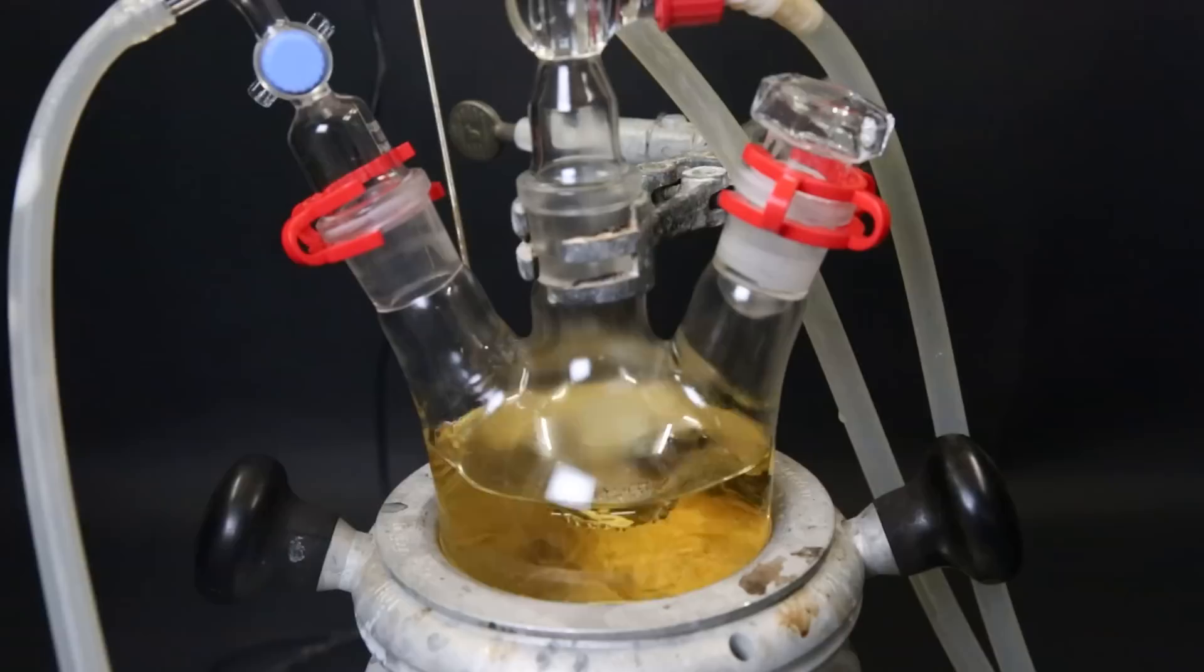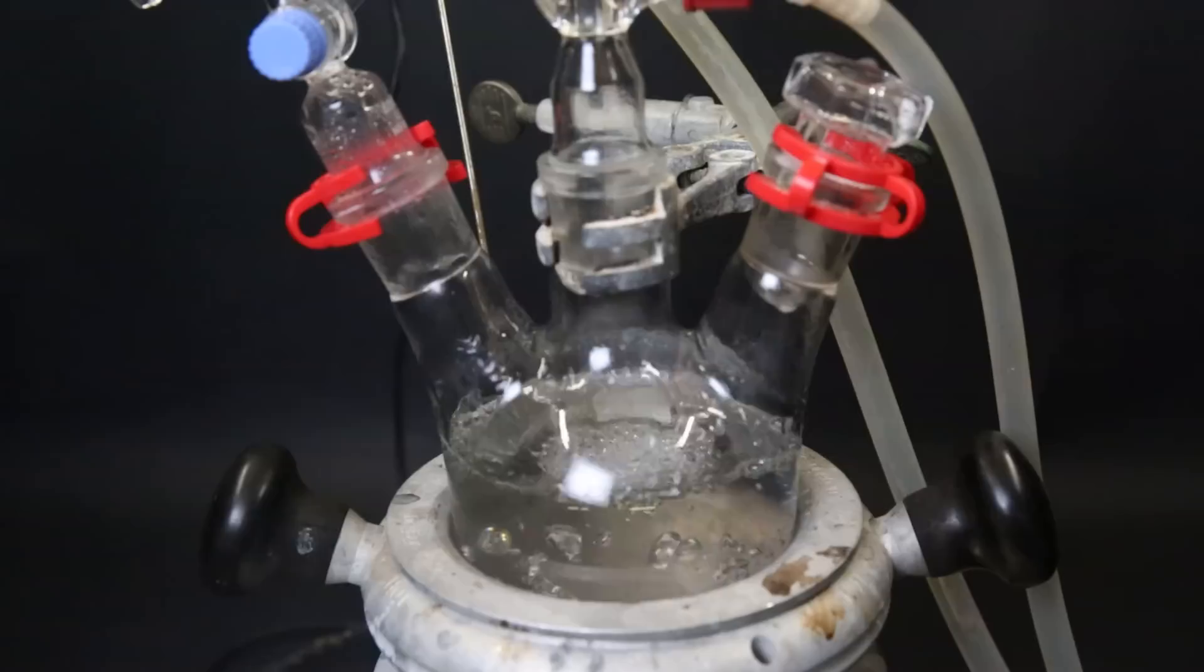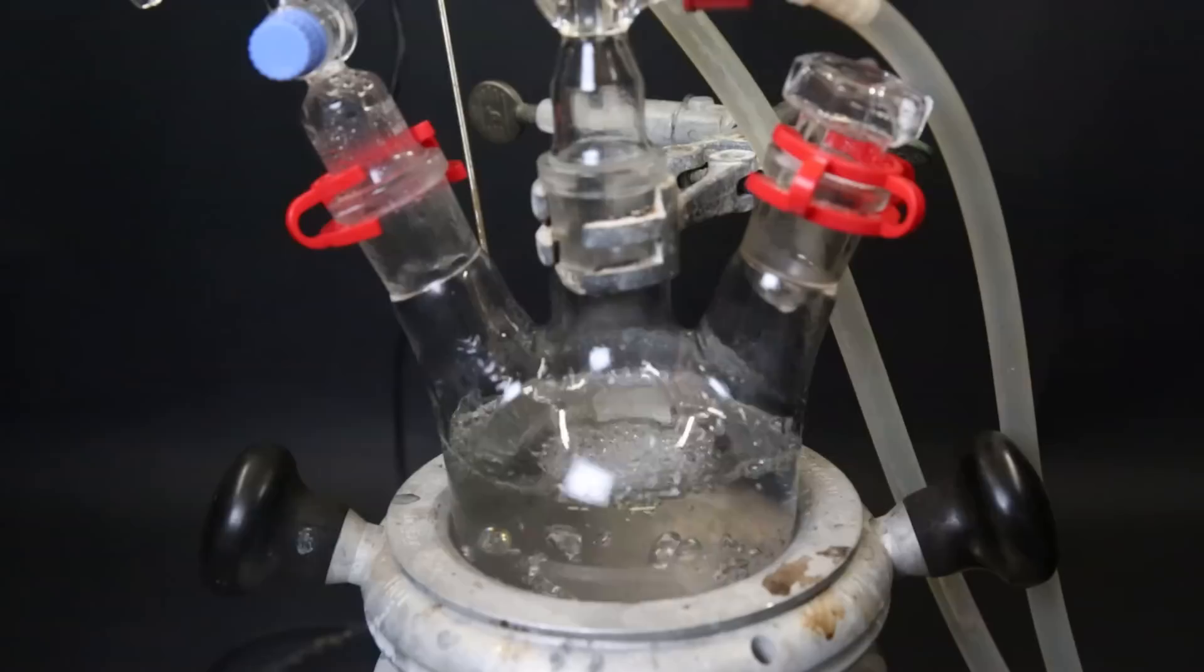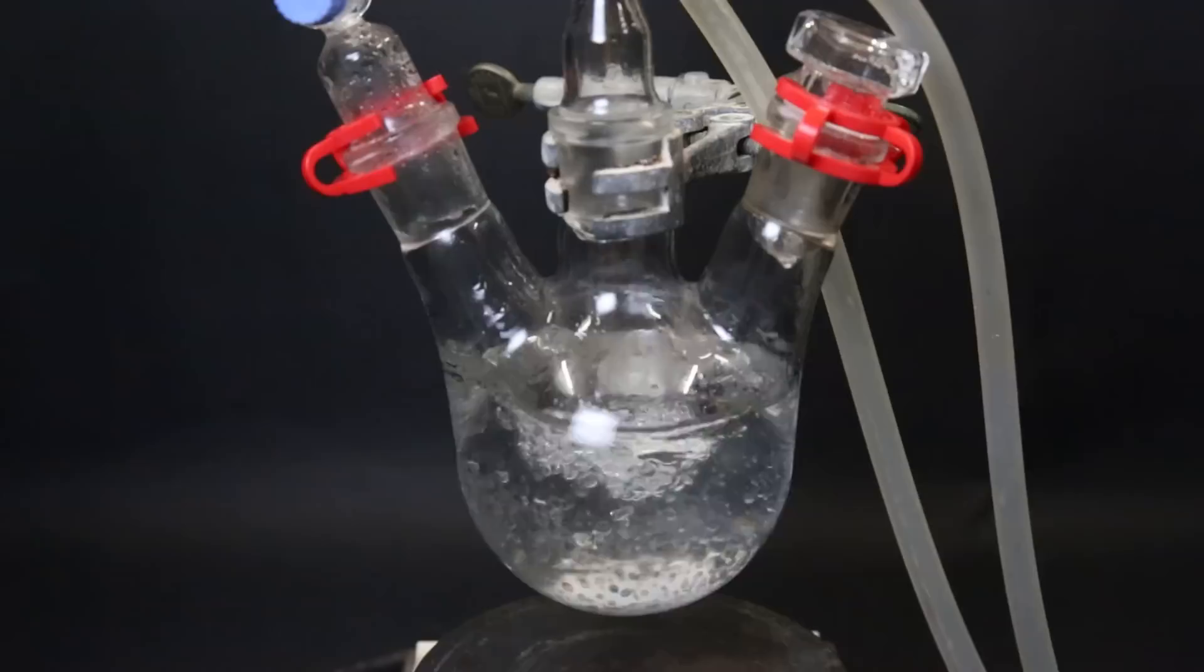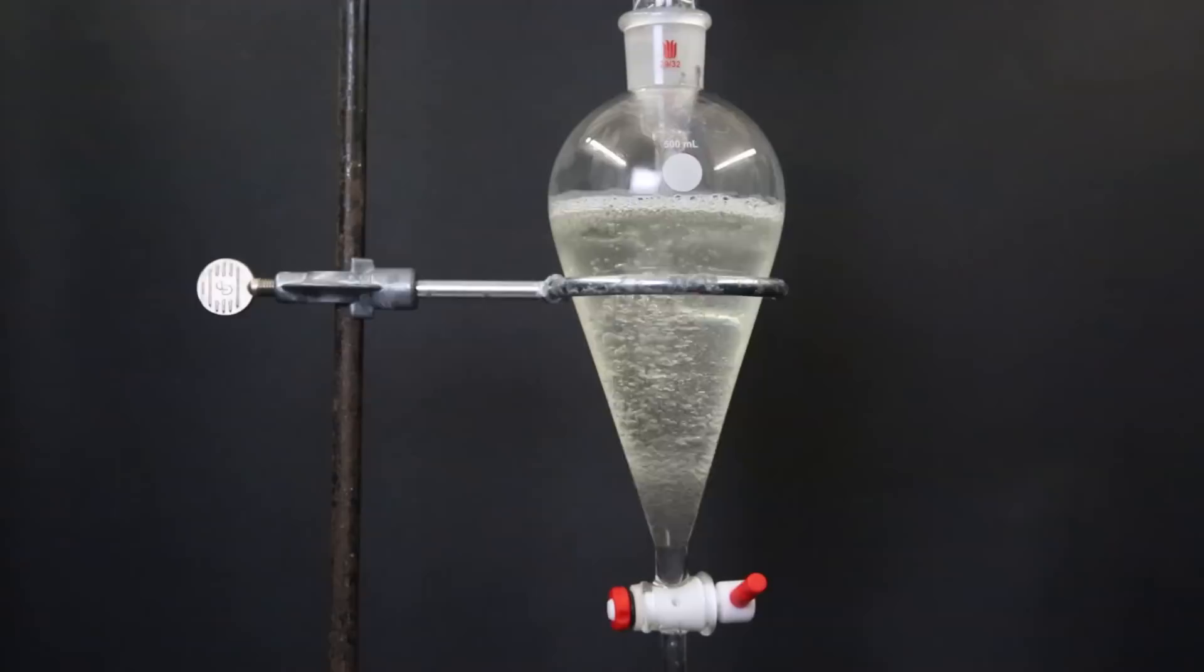Now that everything has been added, I heat the mixture so that it begins to boil, and I leave it to reflux for 24 hours. When I come back, the color has disappeared, and some black powder remains. This is because the catalyst degrades over time, and forms palladium black. I take it off heat, and then let it cool down. And when it has cooled down, I set up a separatory funnel, and pour in all of the mixture. I wash the flask with some fresh toluene, and then drain away the bottom water layer.